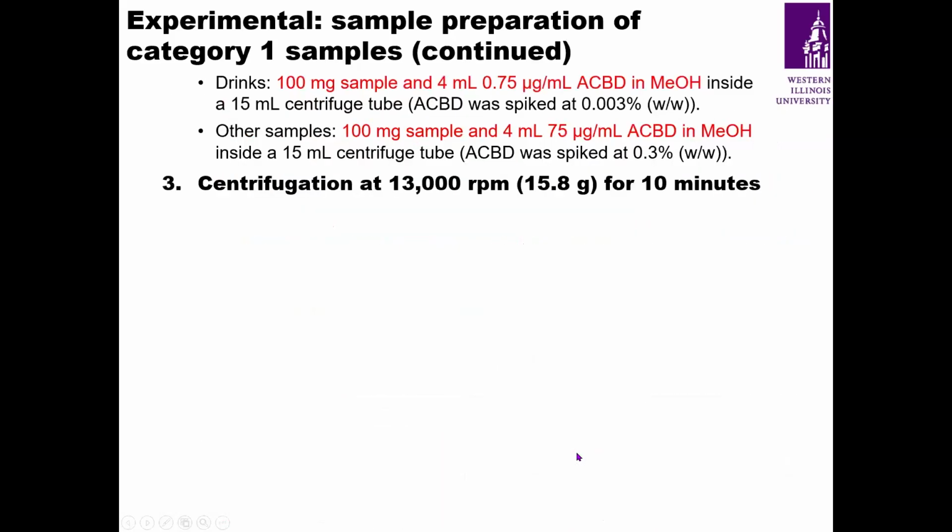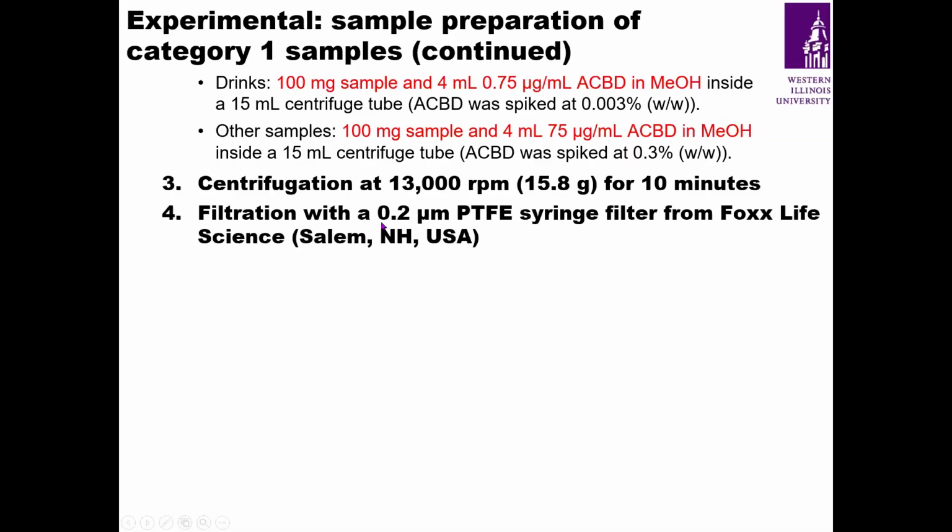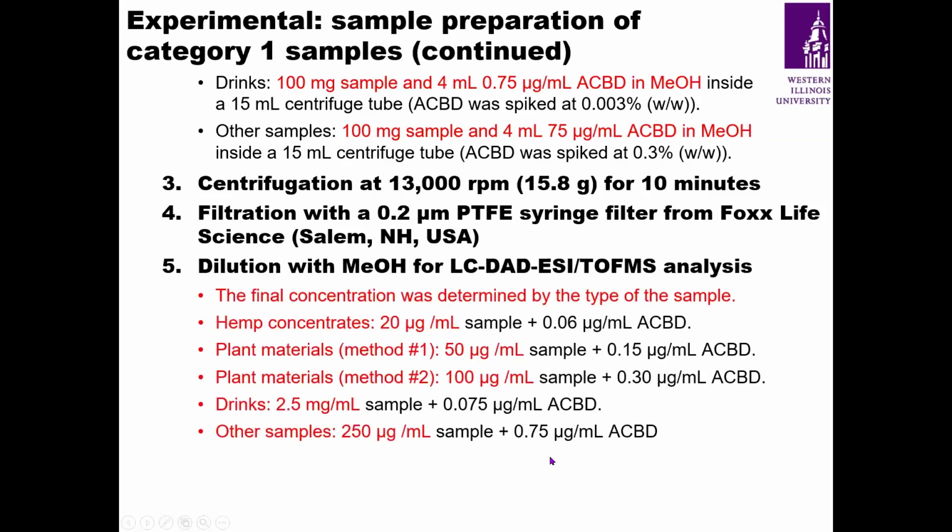The same for all the samples. Centrifugation at 13,000 RPM for 10 minutes. Filtration with a 0.2 micrometer PTFE syringe filter. Dilution with methanol for LC-DAD ESI-MS analysis.